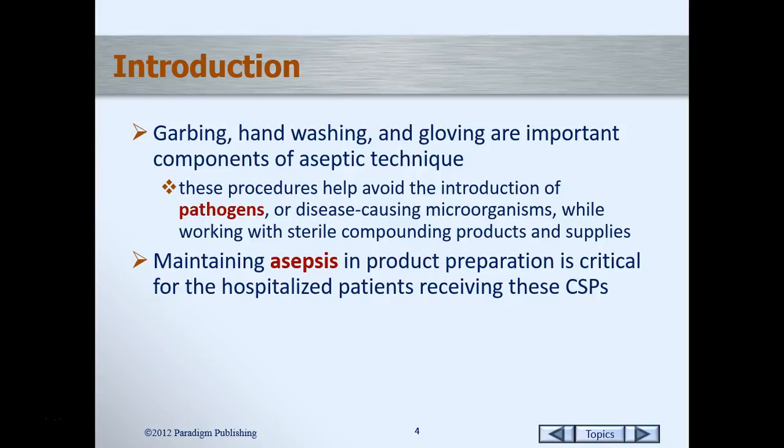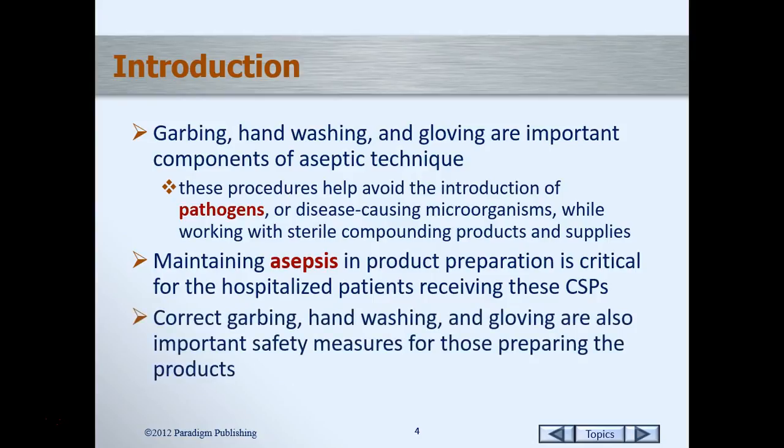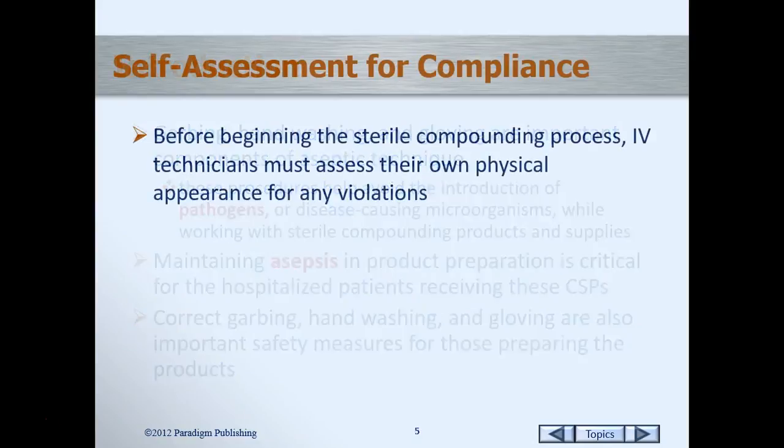Current sterile attire reduces incidence of nosocomial infection. Nosocomial is another term that means hospital-acquired infection, hospital-borne infection, or healthcare-associated infection. Correct garbing, hand washing, and gloving are important safety measures in preparing sterile products.